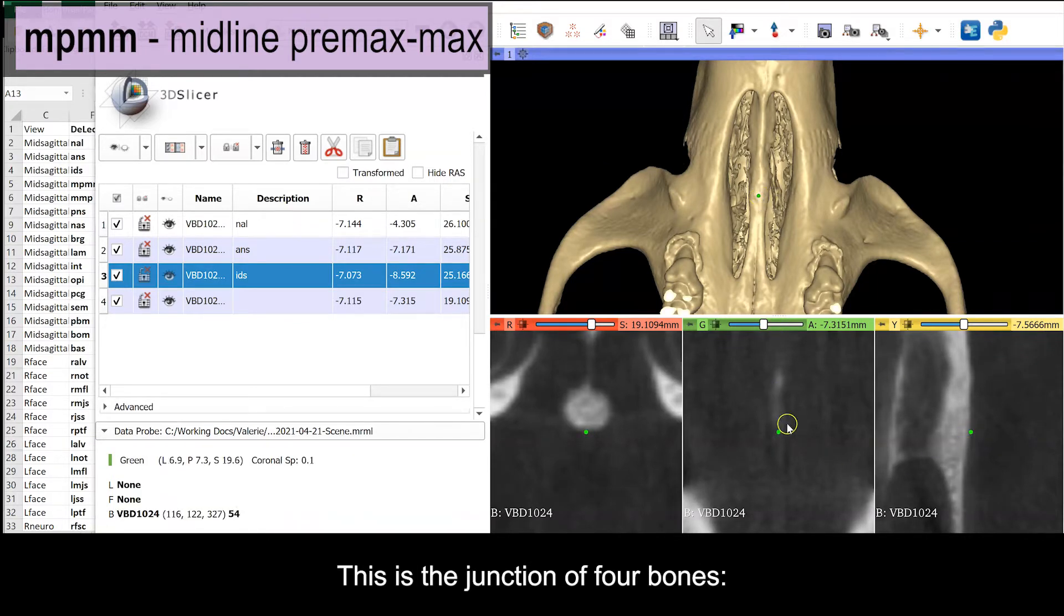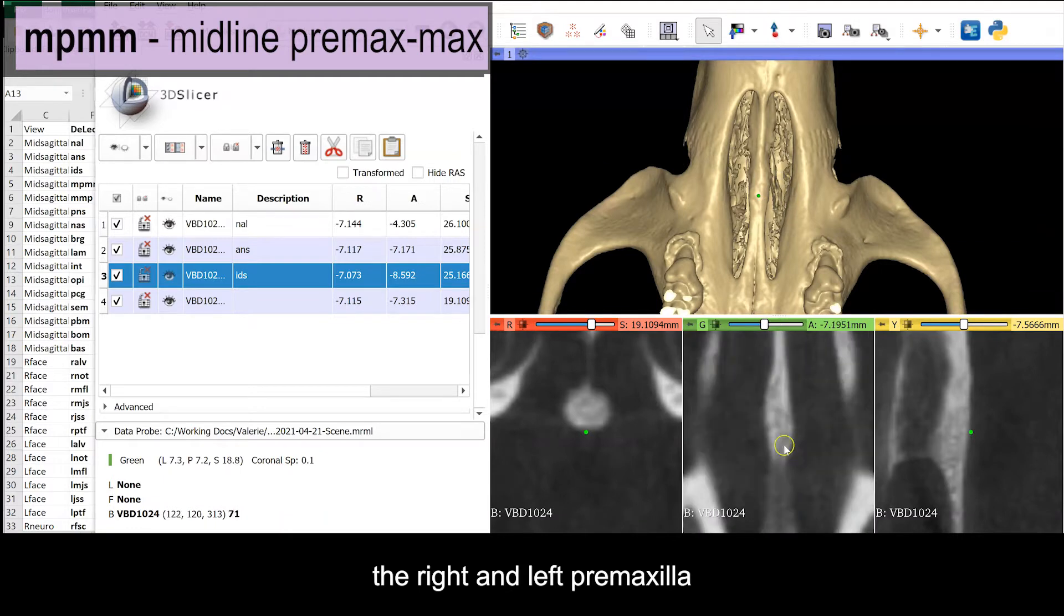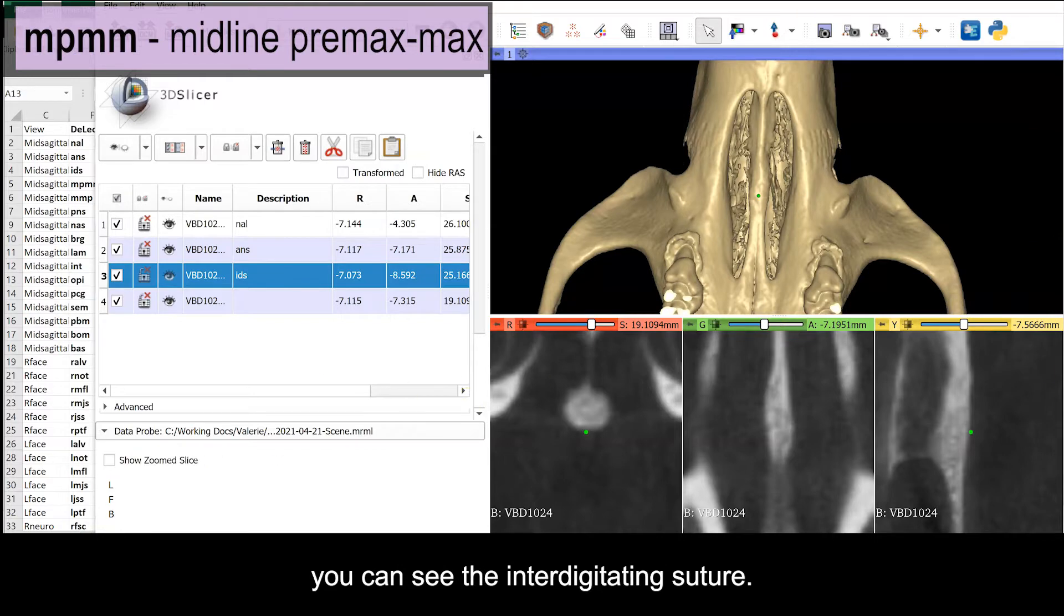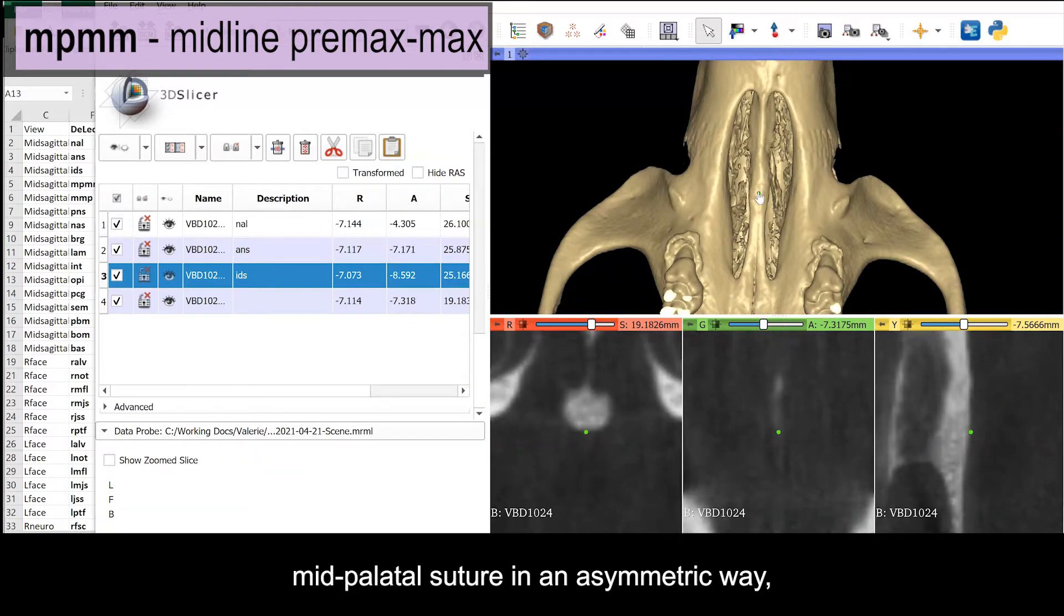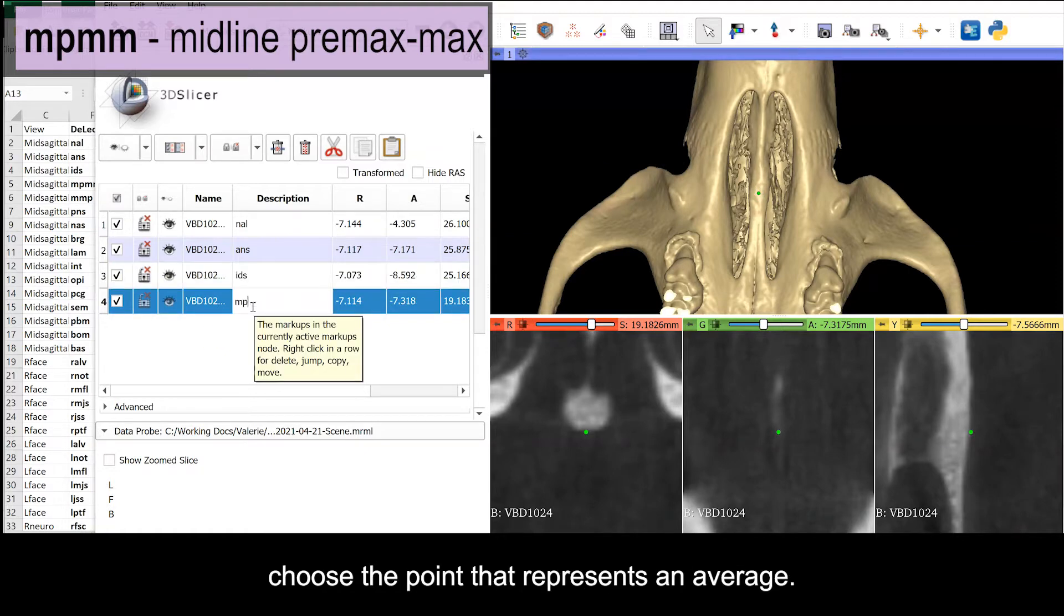This is the junction of four bones. It's the right and left premaxilla and the right and left maxilla. Use the orthogonal views to confirm that the landmark is placed in the mid-sagittal plane. In the sagittal view, you can see the inter-digitated suture. If the right and left sutures are hitting the mid-palatal suture in an asymmetric way, choose the point that represents an average.